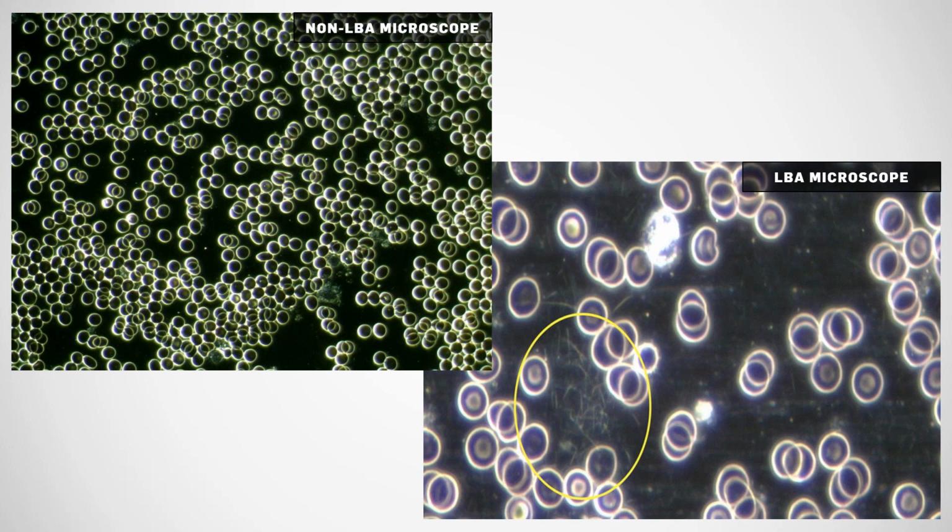So the patterns that we usually look for around the thrombocytes, we're not really able to see those at all. And then all those smaller, fainter patterns between the cells that relate to pleomorphic patterns, we won't be able to see with this type of setup.